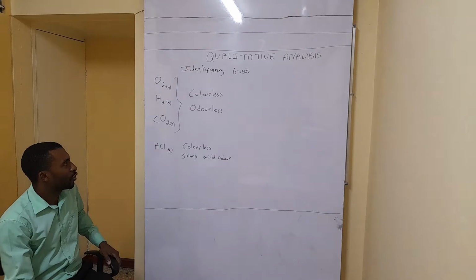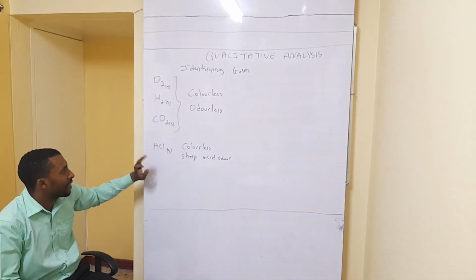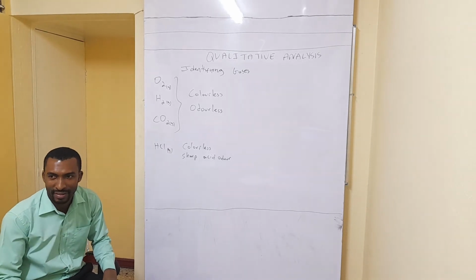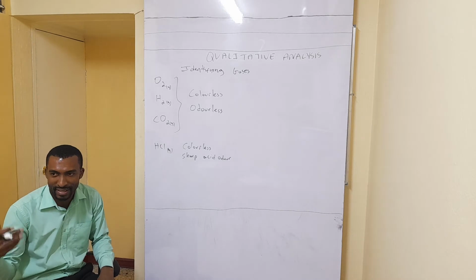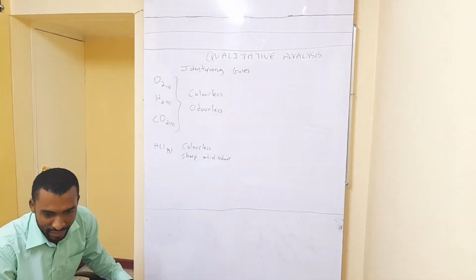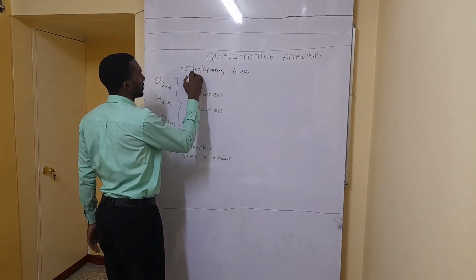Based on just looking and smelling these 4 gases, we can actually tell which is hydrogen chloride, because hydrogen chloride has an acidic smelling odor, like the acidic taste of orange juice. That's how you would tell, it would smell like some acid. So these are the properties.